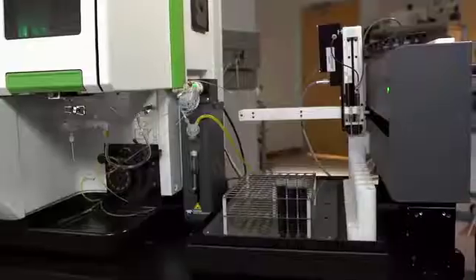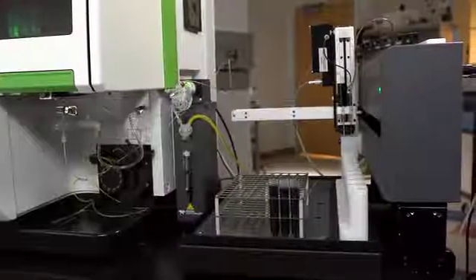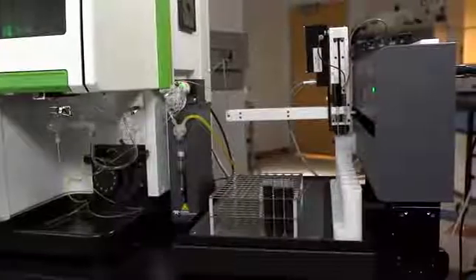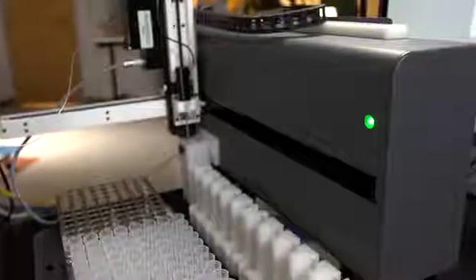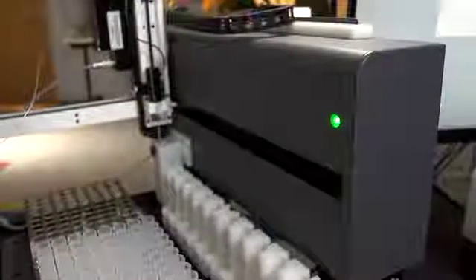Today I would like to present the LPC 500 liquid particle counter coupled to the Avio 500 ICP OES system for combined wear metals and particle counting for in-service lubricant, fuel, and coolant analysis.